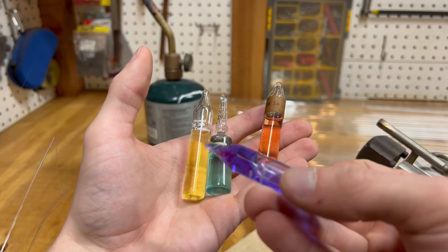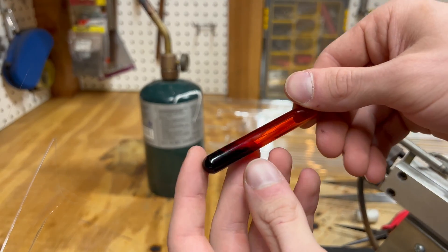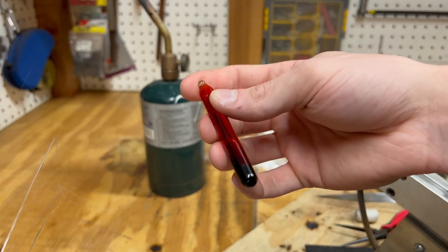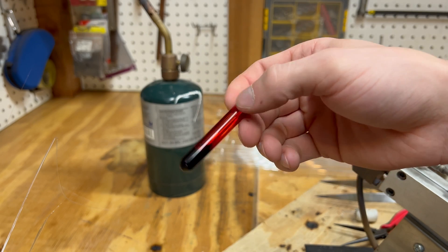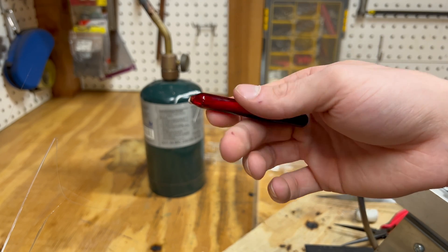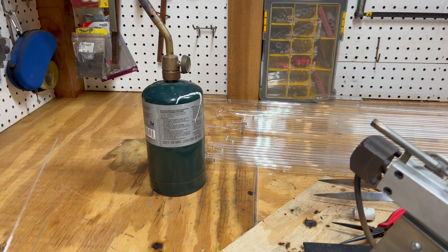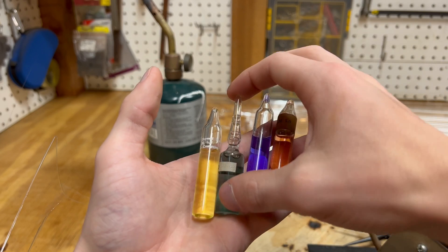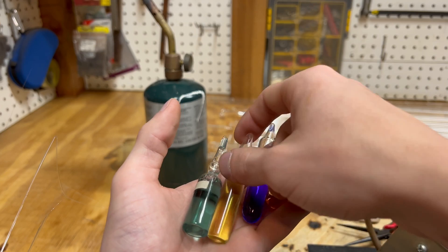Ampoules are the only way to store volatile chemicals long term. Chemicals like bromine are notorious for their ability to leak out of any bottle, no matter how good the seal is. Other chemicals are reactive to air, which leaks into the bottle over time. If alkali metals are stored in mineral oil, even under oil the surface will oxidize and form a skin. But storing them in an argon-filled ampoule, the beautiful sheen of the metal can be preserved.